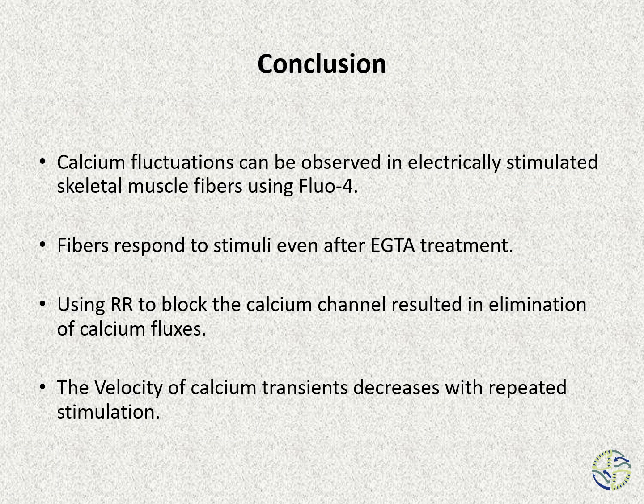In conclusion, calcium fluctuations can be observed in electrically stimulated skeletal muscle fibers, and fibers responded to stimulation even after EGTA treatment, which removed calcium from the extracellular medium. Also, fibers do not respond to stimulation after calcium channel blocker treatment. Finally, the velocity of calcium transients decreases with repeated stimulation.